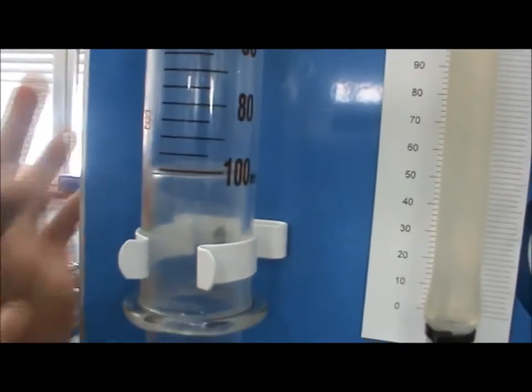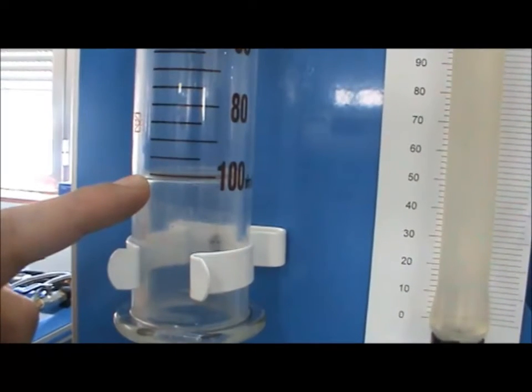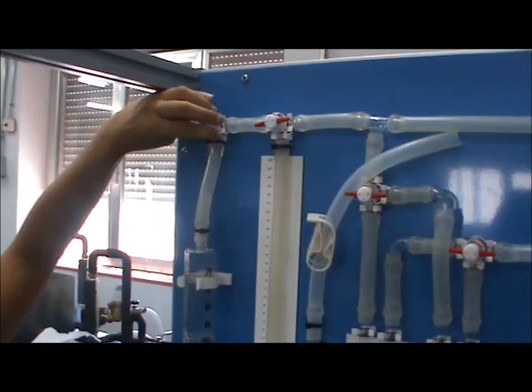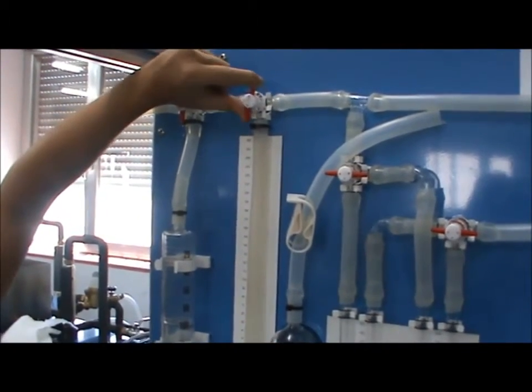Take the final sample of 100 milliliters, and be careful to note how the volume is measured with reference to the plunger in order to maintain consistency with measurements. Close VT3 to isolate the sample and let it stabilize for approximately 10 seconds. Then quickly open VT3 and VT2, connecting the syringe to the U-shaped vessels.